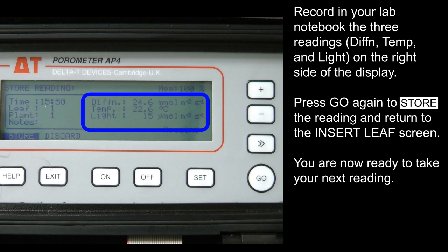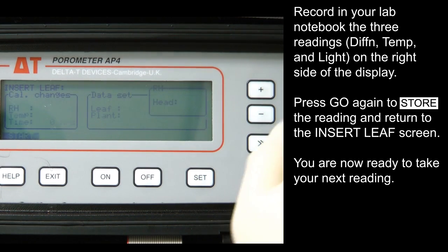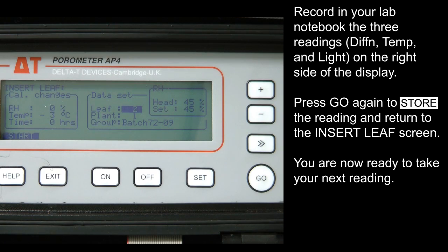Record in your lab notebook the three readings on the right side of the display. Press Go again to store the reading and return to the Insert Leaf screen. You are now ready to take your next reading.